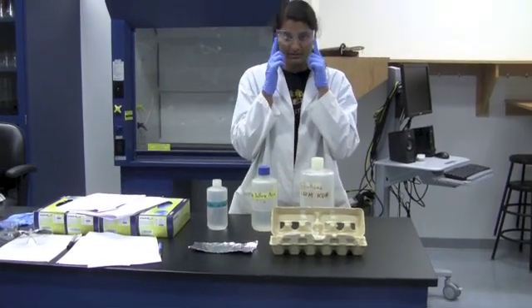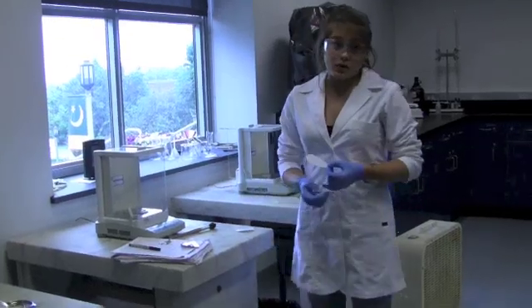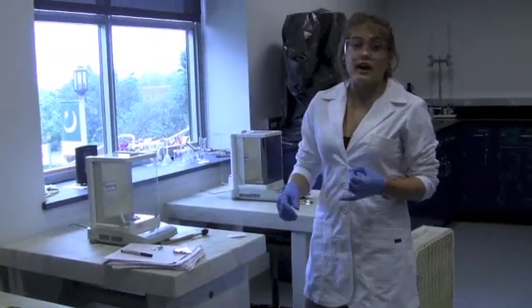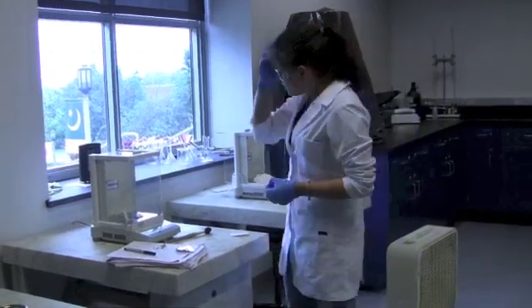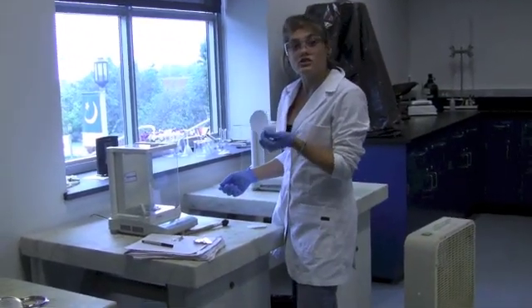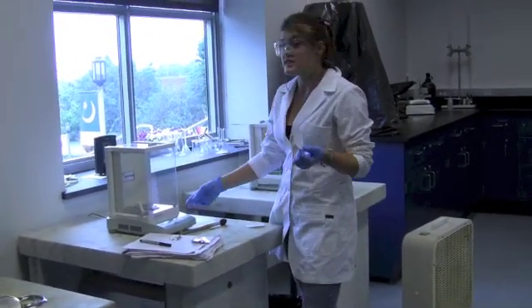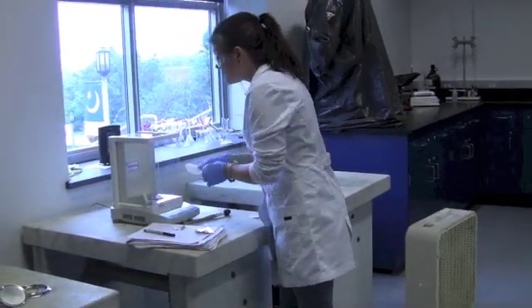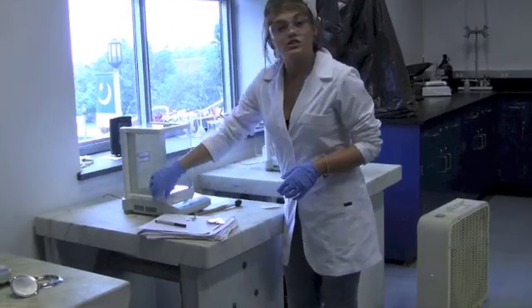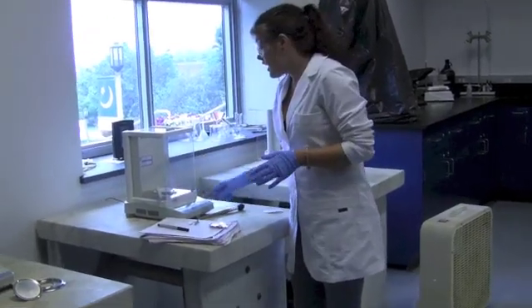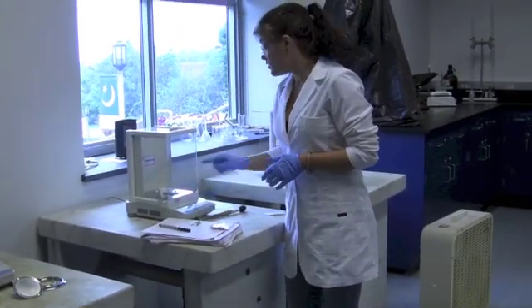The first thing we need to do in this experiment is get approximately 0.5 grams of aluminum foil. When using a scale, always make sure to use a weighing paper so as not to contaminate anything. You place the weighing paper in, close all the doors to make sure that no air disrupts anything, and tare your scale, zero it out.